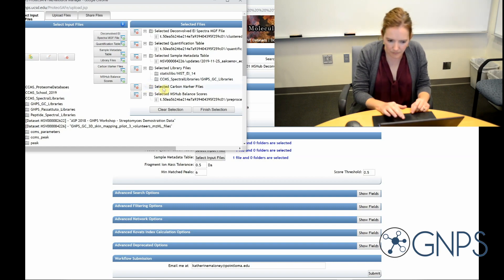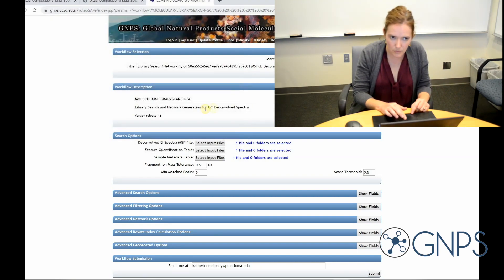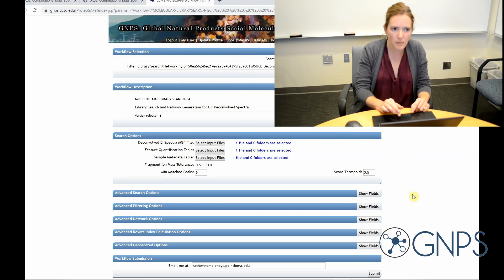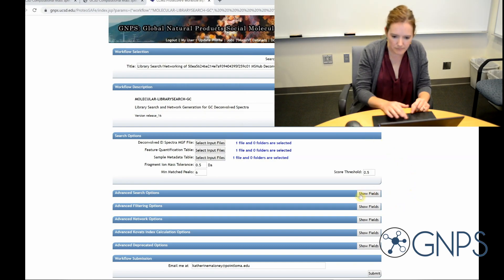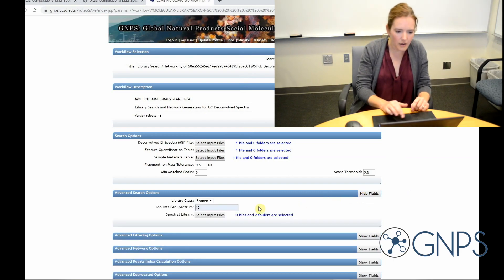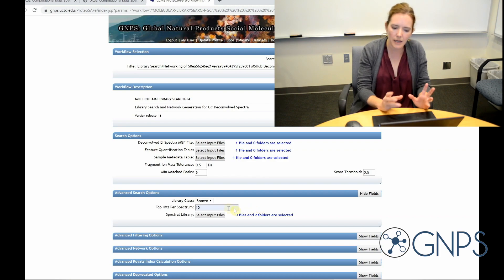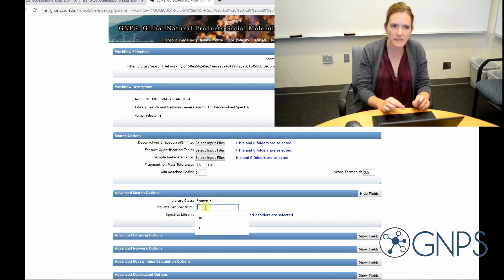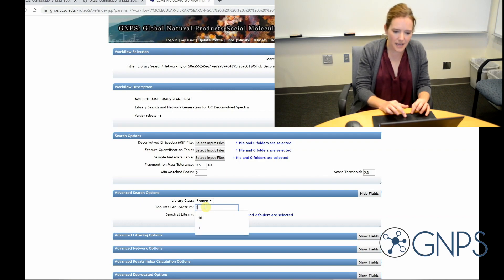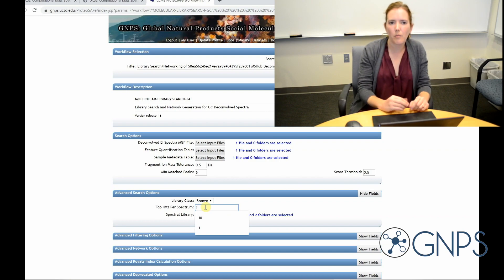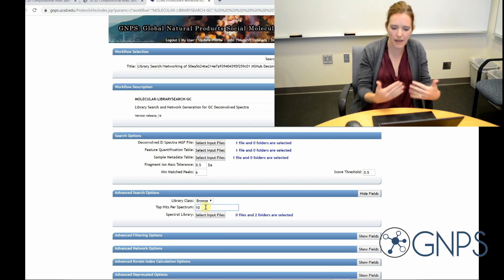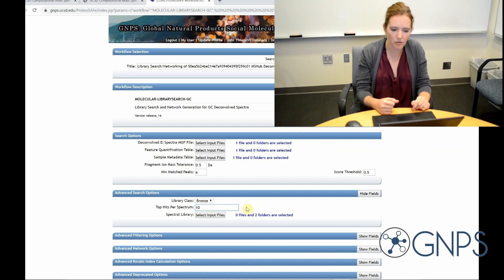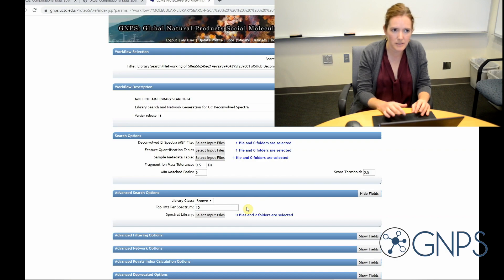Okay, so now I'm going to look at some of these advanced search options. So here this setting called top hits for spectrum is going to tell you how many library hits it's going to provide you for each of your GCMS spectra. I'm going to set it at 10 so that we get the top 10 hits that meet our criteria. And then we can always manually look through them and see which one makes the most sense.